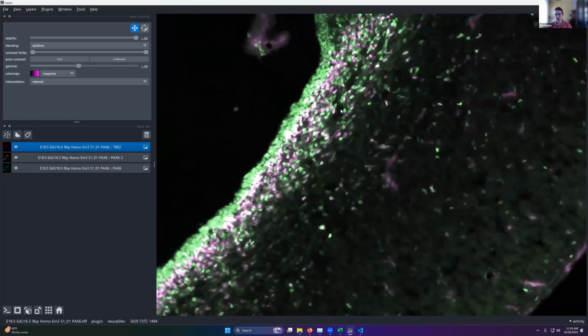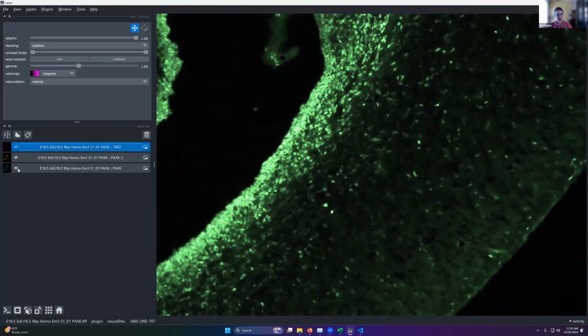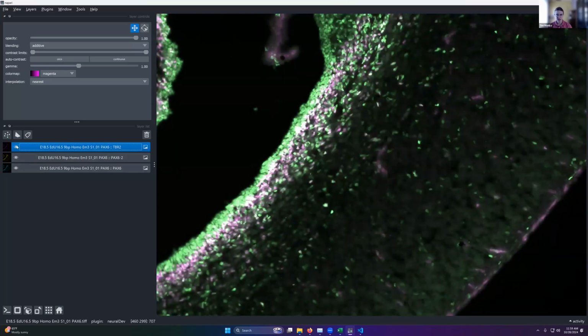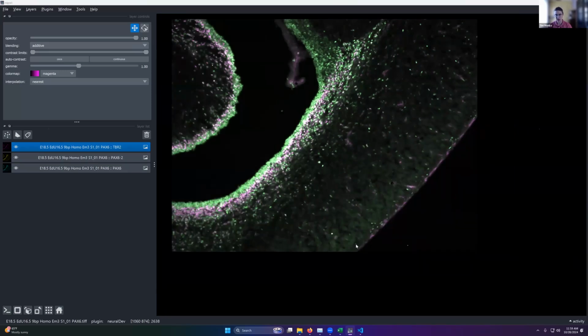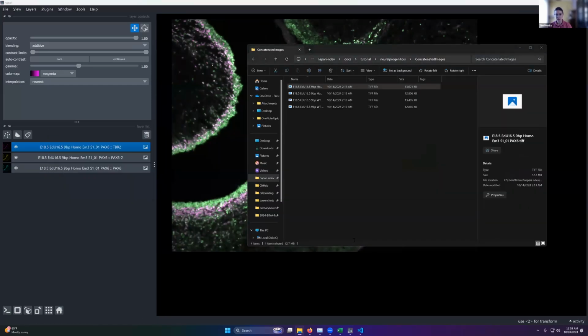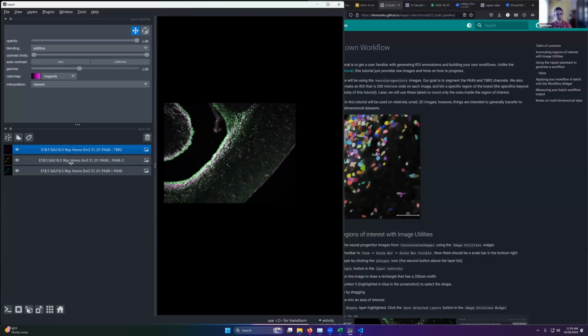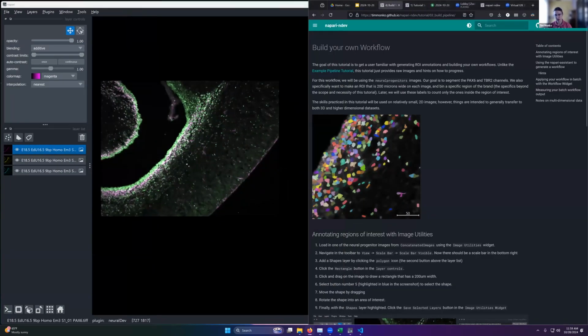I'm just going to open that first one in the link. Here you can see something goofy, as I mentioned. It duplicates the data into this channel. That's all right for our purposes, but here's the difference in them. And our goal is to segment these images so that each nucleus has its own label. These are transcription factors in wide field fluorescent microscope images.